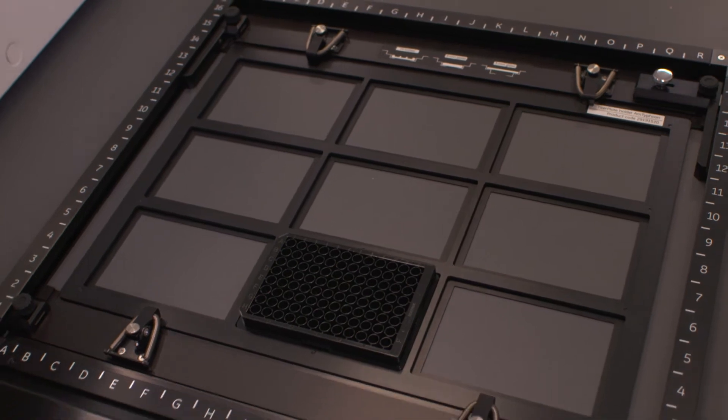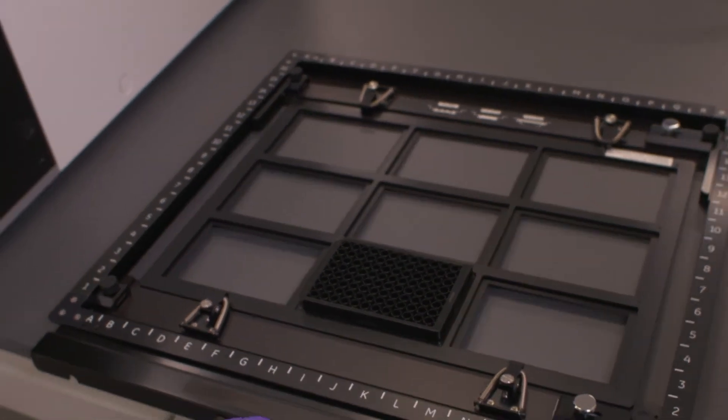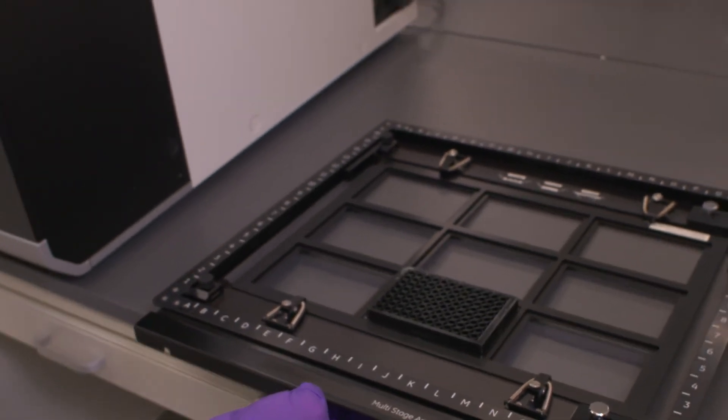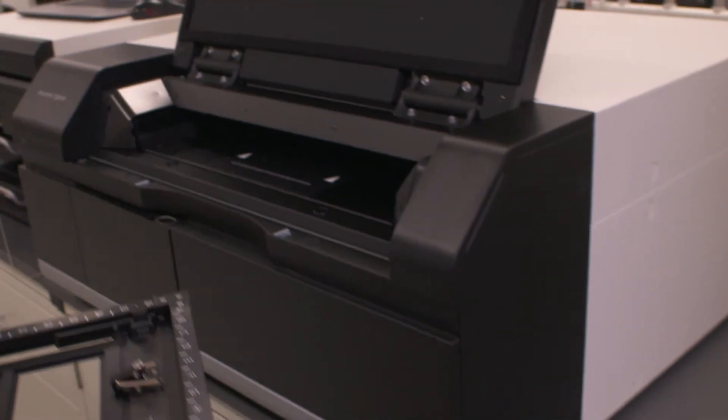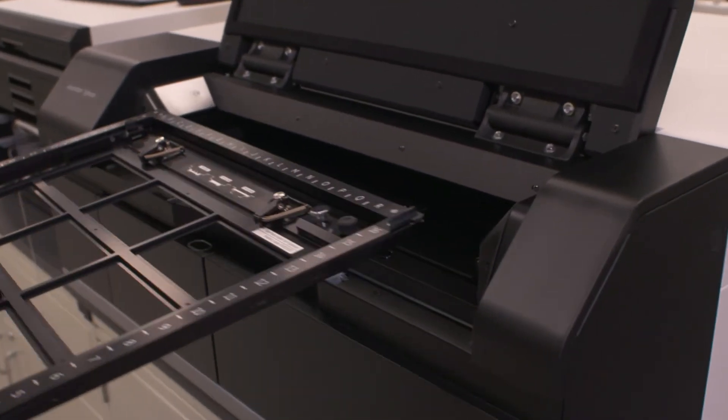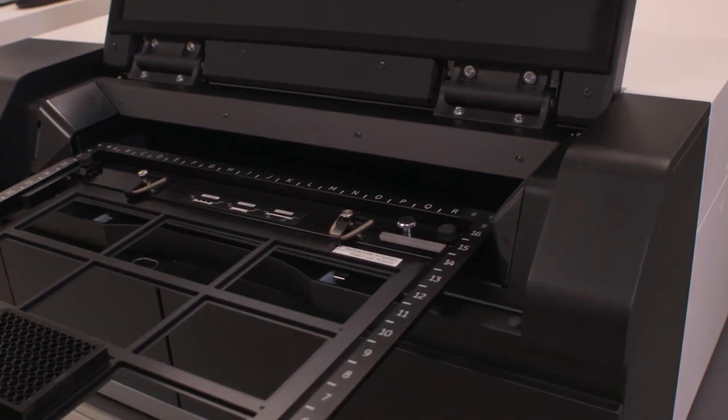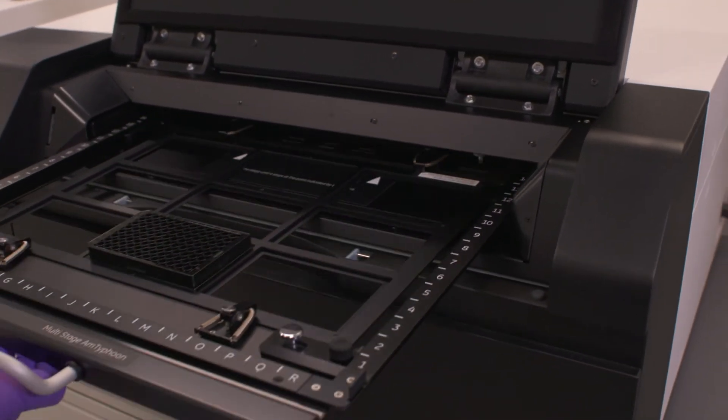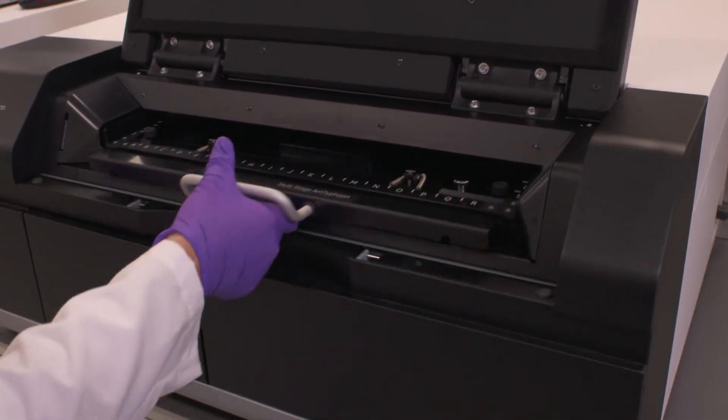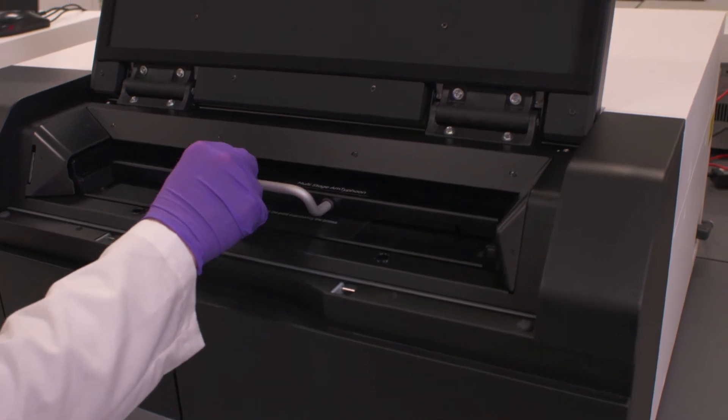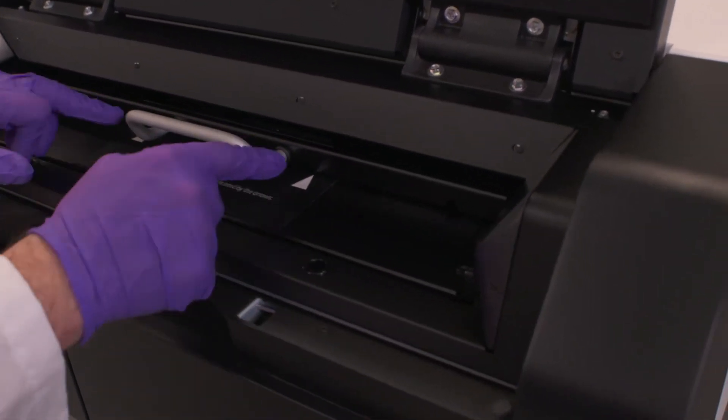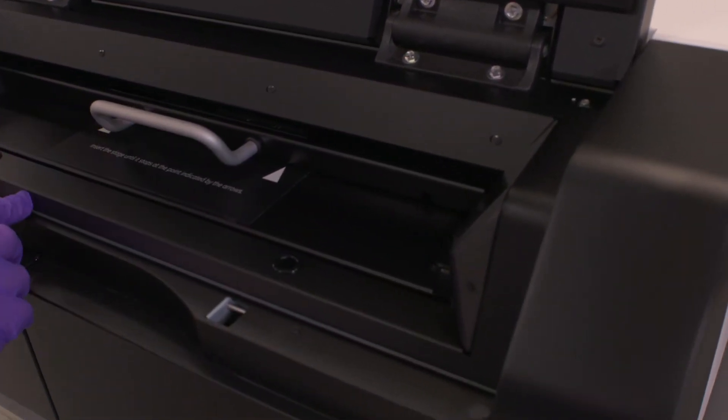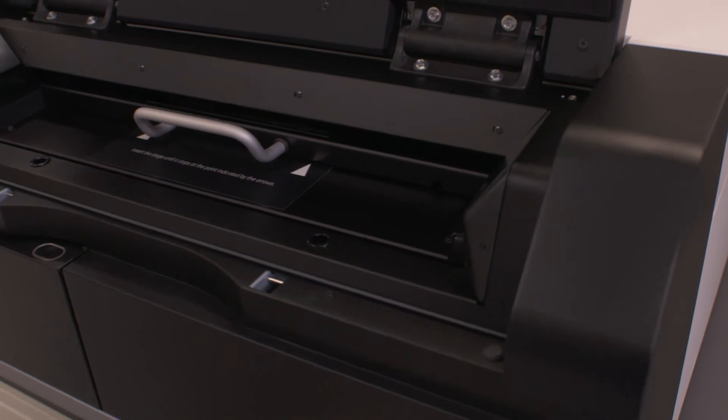We're now going to take this stage and place it into the Amersham Typhoon. Place this on the runners. Slide that in. Make sure we see the apex of the two triangles, know it's locked into place.